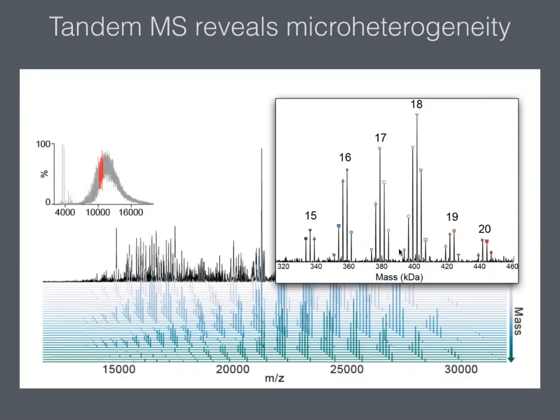So what you see in this case, for that particular isolation, is oligomers made of 15, 16, 17, 18, 19, 20 subunits, but different combinations that give rise to that overall oligomeric state. In other words, a 16-mer could be 8 and 8, or it could be 9 and 7, etc. And so with the mass spec, we can quantify the relative abundance of all of those for the particular slice that we interrogated.